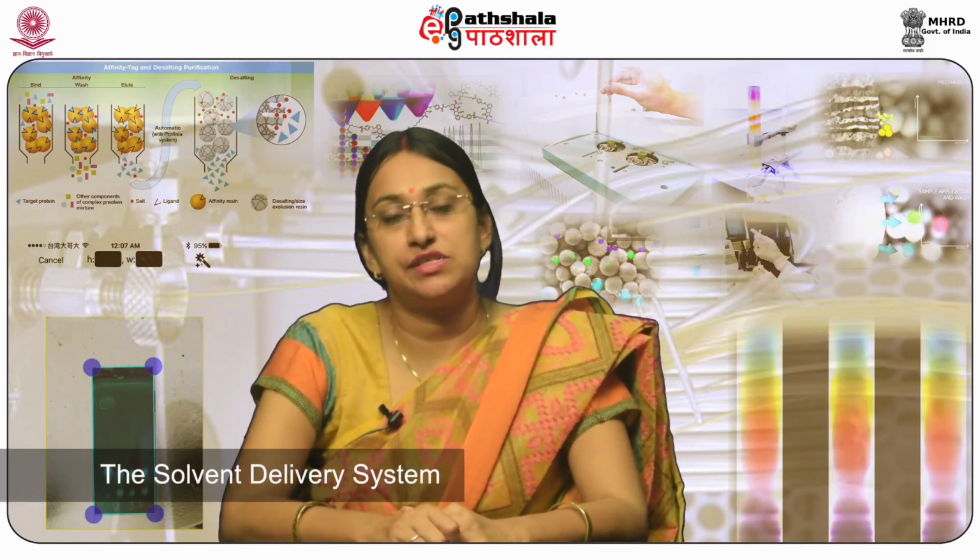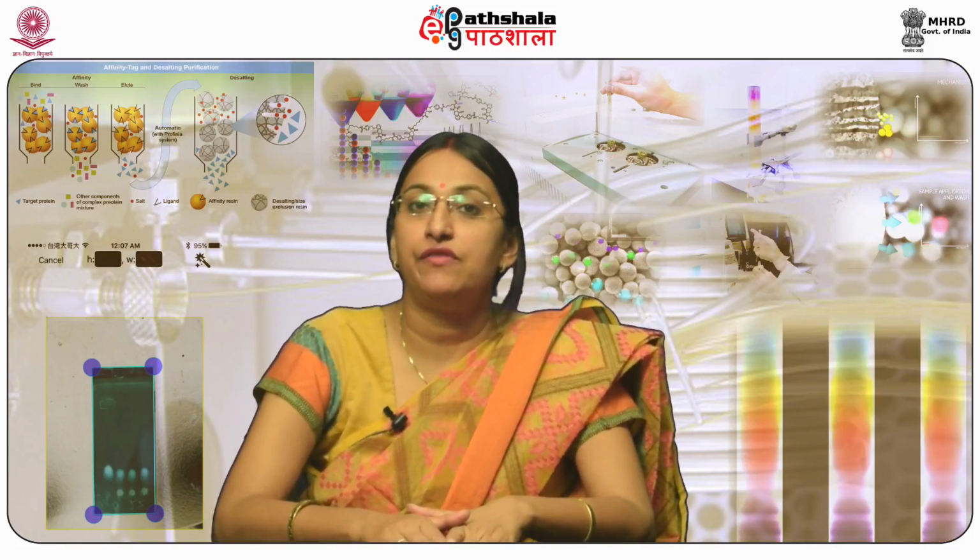Solvent delivery system. The solvent delivery system is an essential component of HPLC. It is meant to deliver the mobile phase to the column with a constant and pulse-free flow. The efficiency of the system and reproducibility of retention time is directly affected by the flow rate.